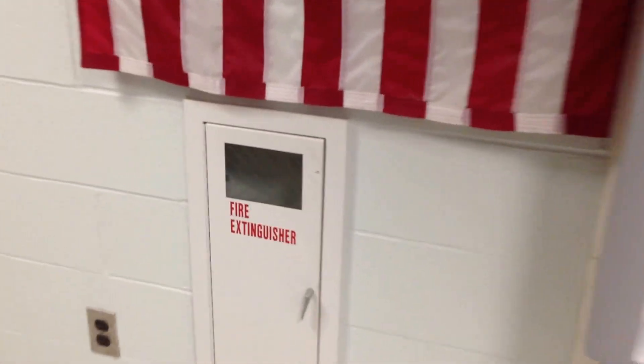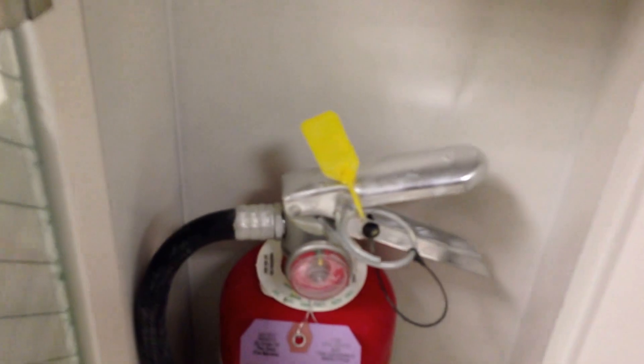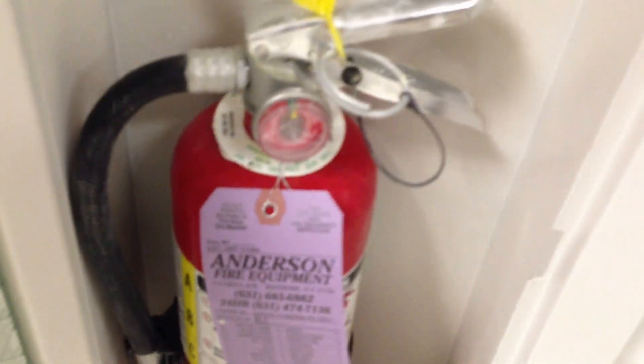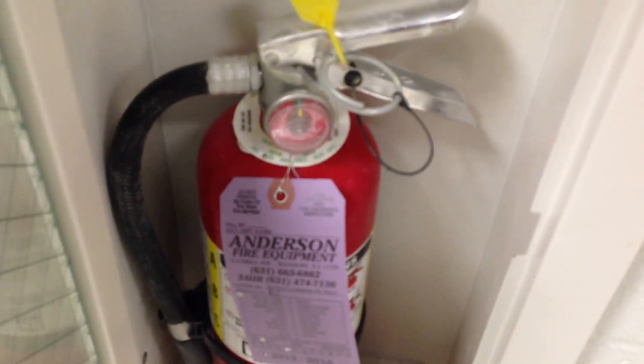And this is a CO2 fire extinguisher. In this fire extinguisher, too bad I can't break the glass here, very simple to operate. You take out, you pull a pin. If you've ever used a hand grenade, that's what you would do. You pull the pin, hopefully you haven't, and you would squeeze down on this handle and direct the CO2 right onto the fire.